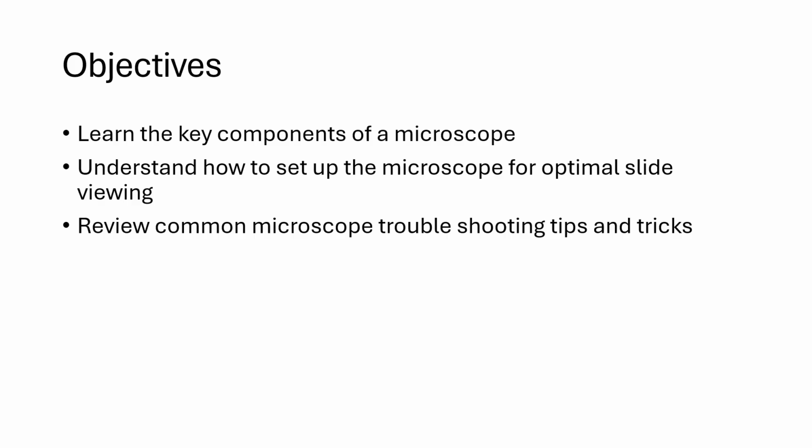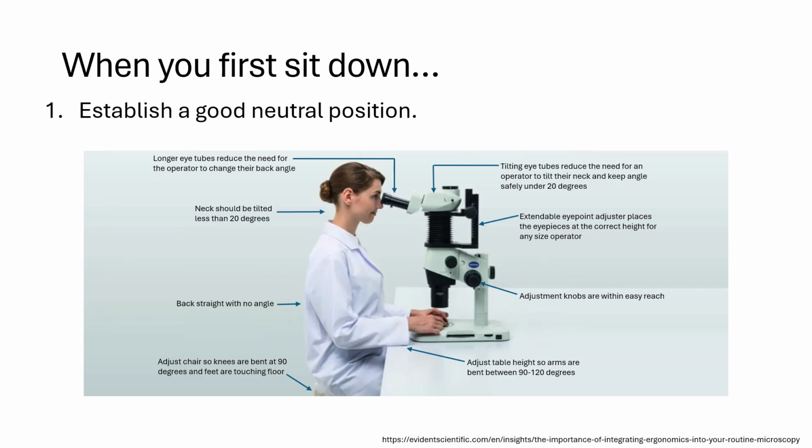The objectives of this course are to learn the key components of a microscope, to understand how to set up the microscope for optimal slide viewing, and to review common microscope troubleshooting tips and tricks.